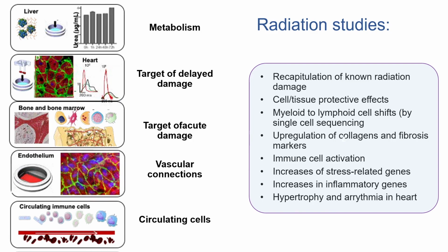So one application of the platform was to look into the effects of radiation on human tissues. This was very directly initiated by the interest of NASA. They wanted to model how astronauts would be responding to long-term exposure to the space radiation during long flight space missions. The other obvious application is for clinical radiation for treatment of patients.